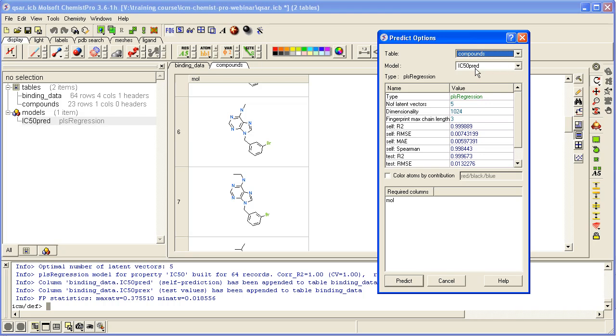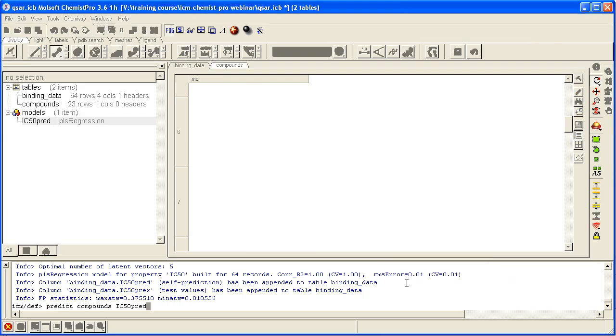The model that we're going to use is the one called IC50 predict, and we go predict.